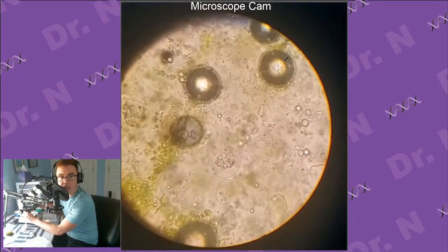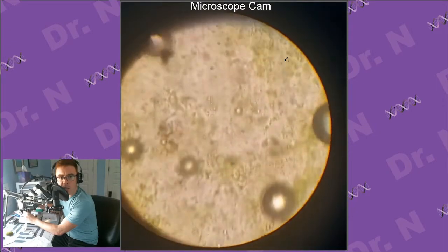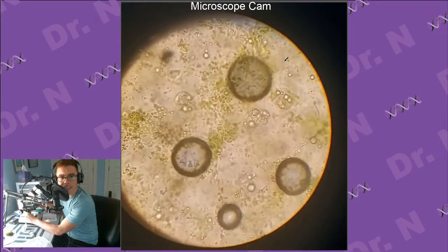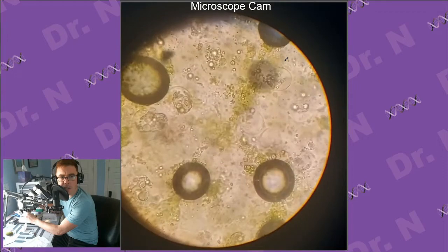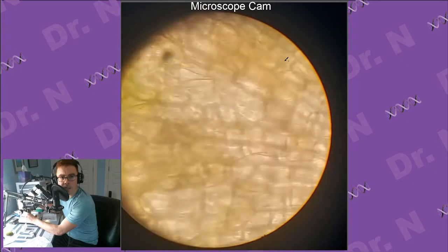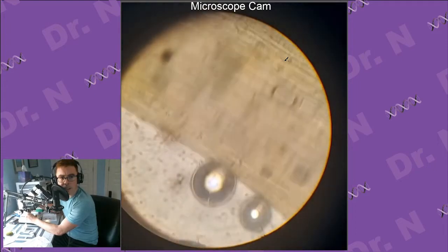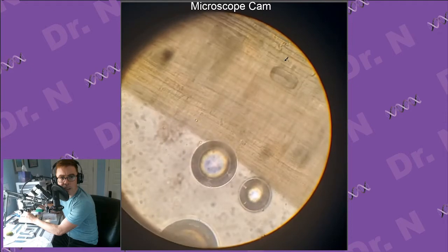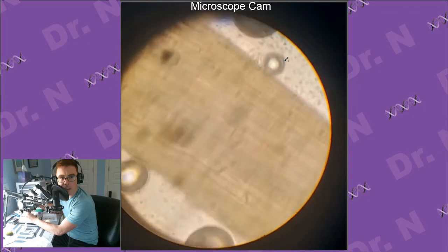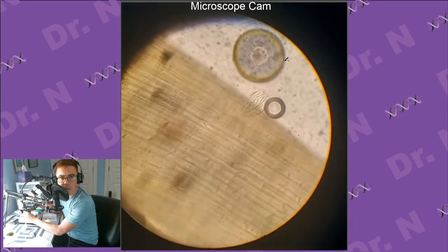But I do know on the periphery there was some other cell debris, so that's what I'm going to look at really quick. Yeah, it just looks like cell stuff. Nothing too exciting. Let's go to the end. This is what I wasn't sure about, whether or not there'd be any little guys hanging off on the outside.